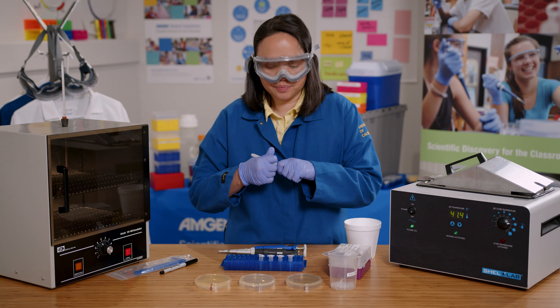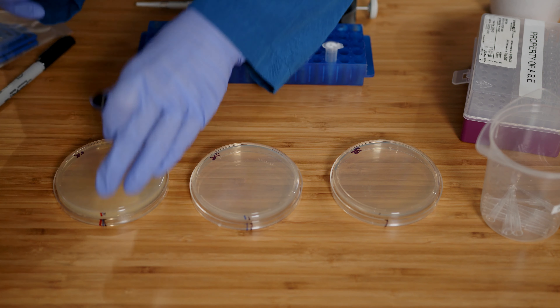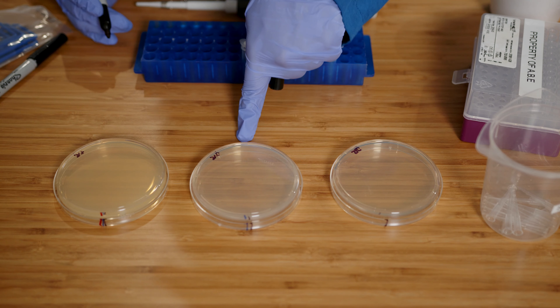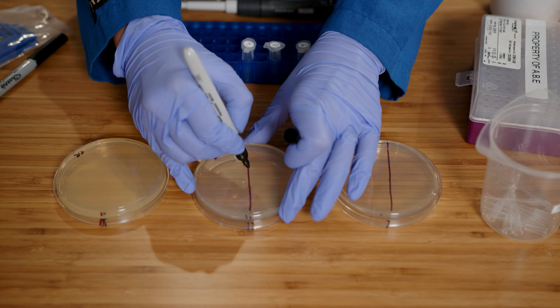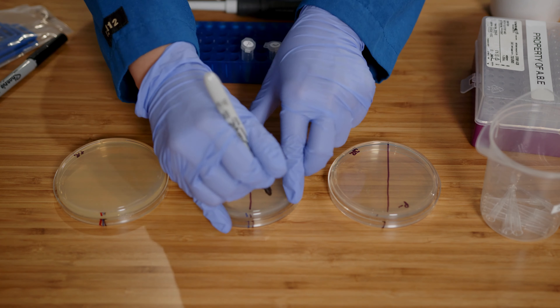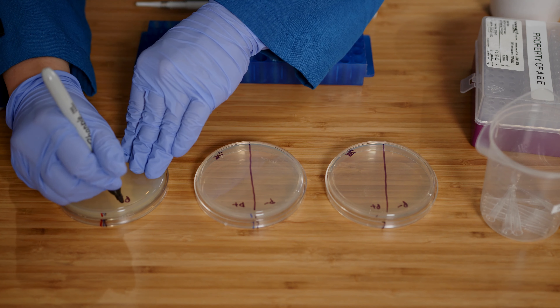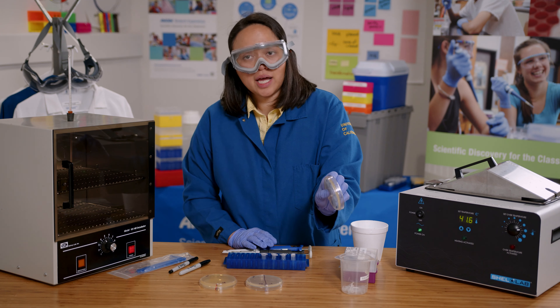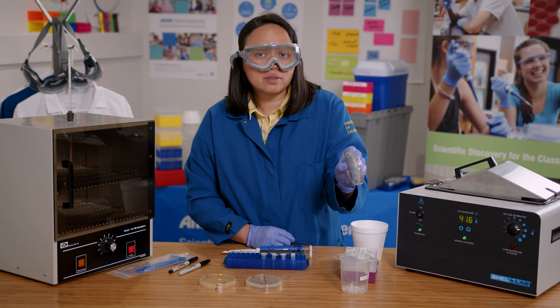First, I'll label the plate with my initials. Then I'll draw a line down the LB and LB amp plates, and label one side of each with P- and the other side with P+. On the LB amp arabinose plate, I will only write P+. Notice that my plates are labeled on the outside and on the bottom, with small writing on the edges so that most of the plate is still visible.